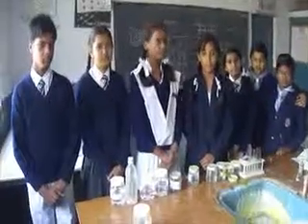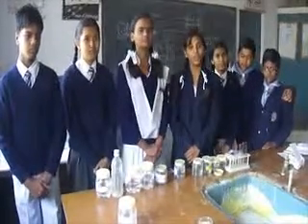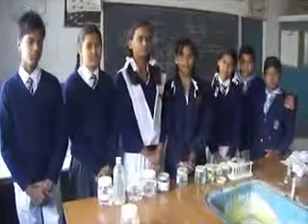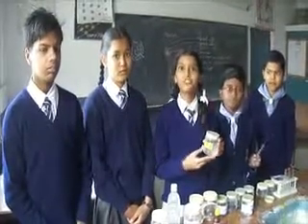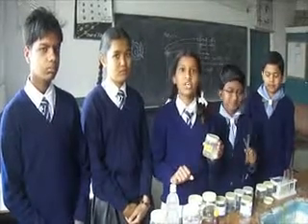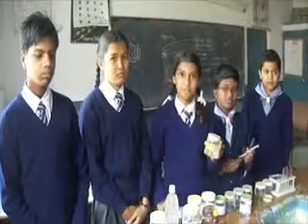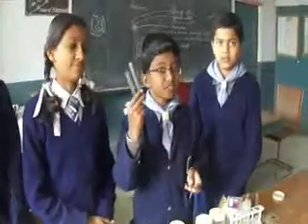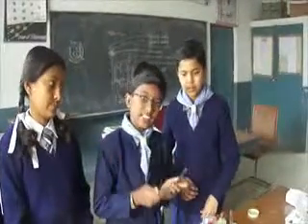Is there any procedure to test the presence of fluoride in water? To test for the presence of fluoride in water, we are going to perform some experiments. This is a sample collected from New Adarsh Colony, Guna, Madhya Pradesh at 5:30 p.m. on 24 January 2012. First of all, wash the measuring cylinder, test tube and cork with the sample of water to be tested.